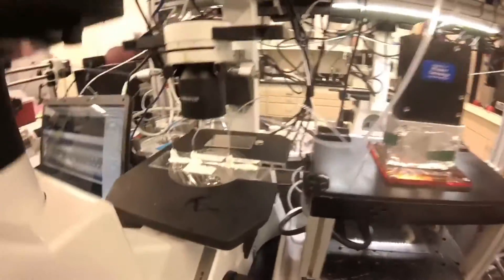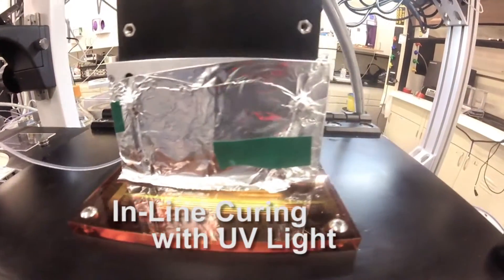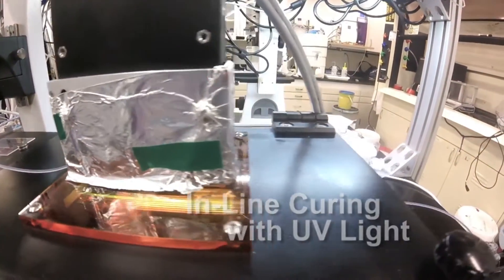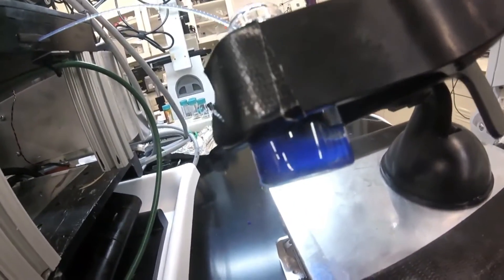After the drops are generated, they run into this in-line curing unit which has UV light to cure the polymer in the shell phase. Eventually, you get capsules coming out of the tubing which are then collected and used for CO2 capture.